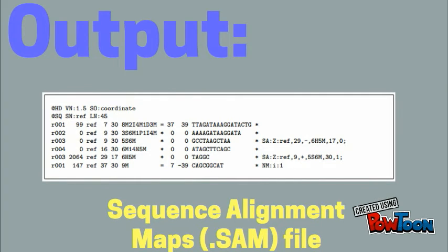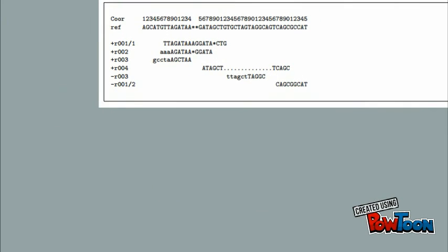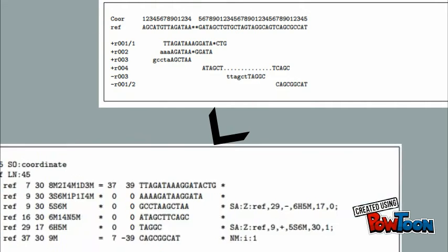The product of Bowtie and Tophat is a sequence alignment map, or SAM file. The file itself is a text file that contains each sequence read along with multiple acronym codes that indicate where the sequence is located, if a splice junction exists, and whether or not part of the sequence code fits into the reference. Strict interpretation of this file yields a more easy-to-read alignment map.